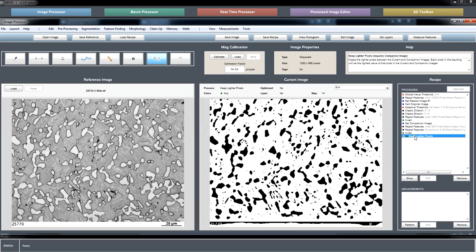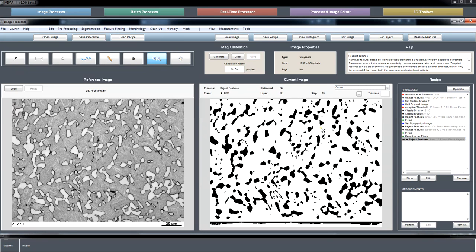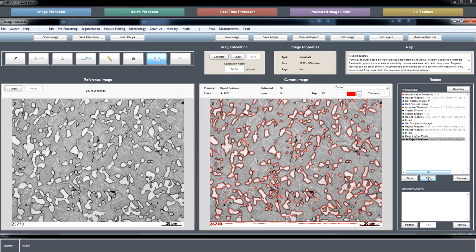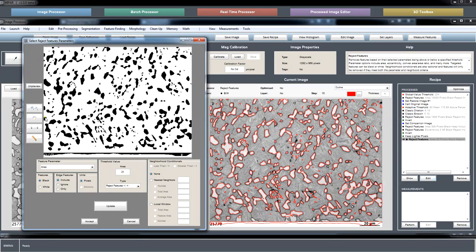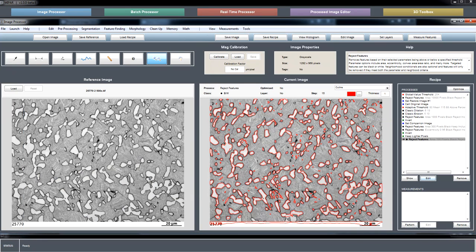We've got rid of the reject. We've got rid of the eccentric features, and now what's left is we know that very, very small features obviously are going to go away. So there's no way that's an equiaxed alpha particle. So I can probably confidently say anything under 25 can get tossed away. And maybe we can even go a little stronger with that. Probably the smallest equiaxed alpha we'd like to remain is that. So anything under 100, let's do away with.